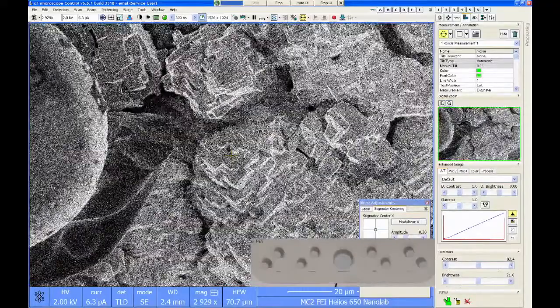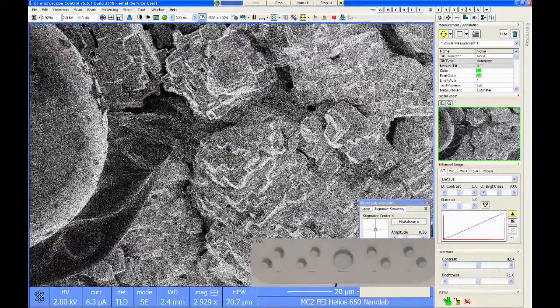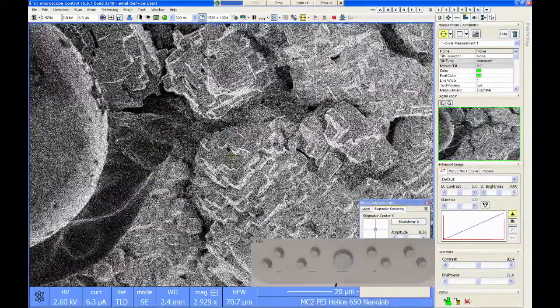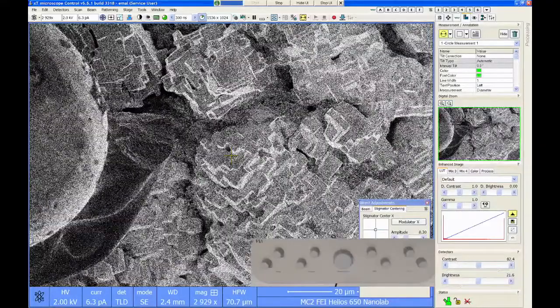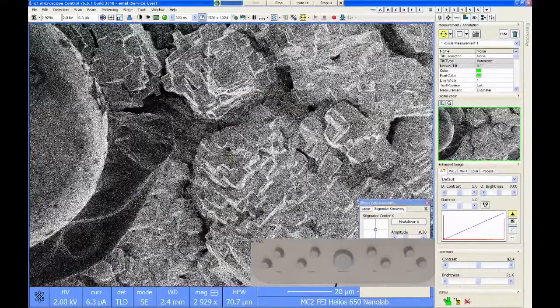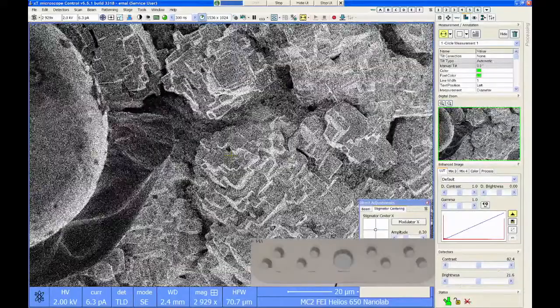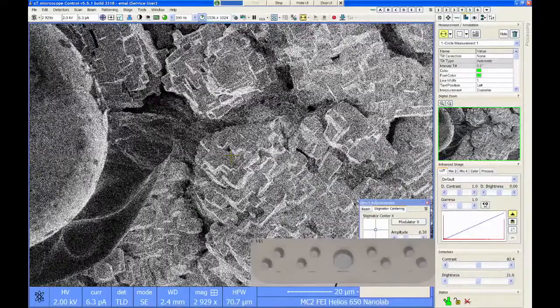But yeah, the real advantage with SEM is that if you're trying to look at like the outside morphology of the sample, you have to do it by SEM because in TEM you're looking at a transmission image. Right. So you always lose that kind of structural information. But for just measuring like a diameter of a particle, a TEM is going to be easier, I think. But that's assuming you can get the particle onto like a carbon grid or something like that. Okay. Now we can do FIB lift outs. We can make, there's various ways to prepare samples like that to image nanoparticles deposited on the top of a surface. It's just different sample preparation strategies to do that.